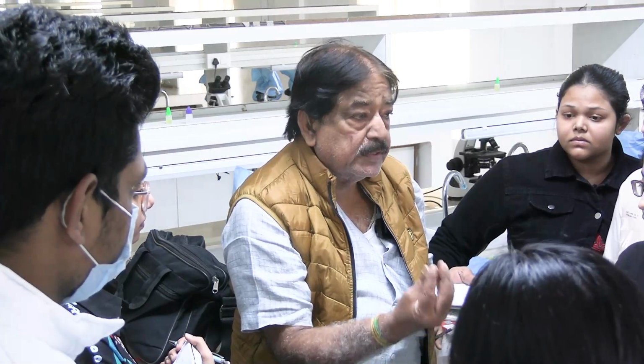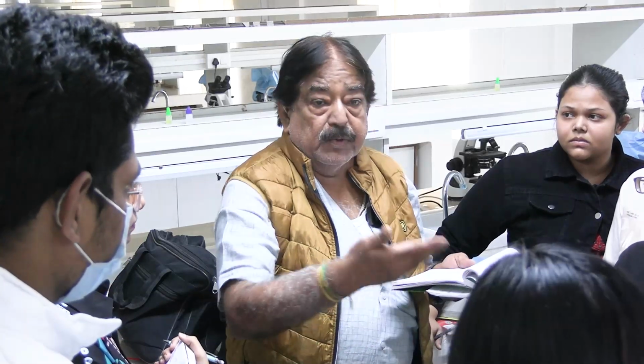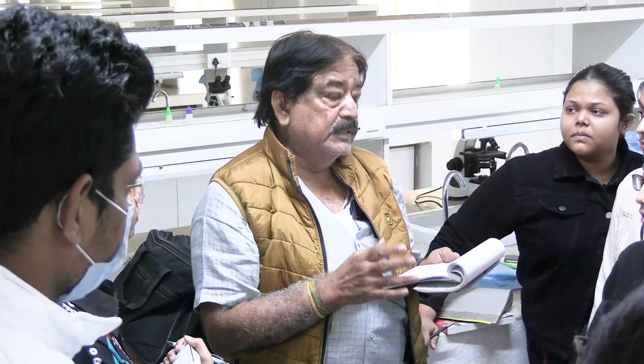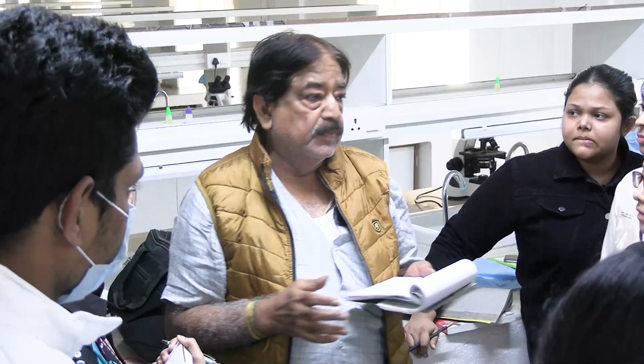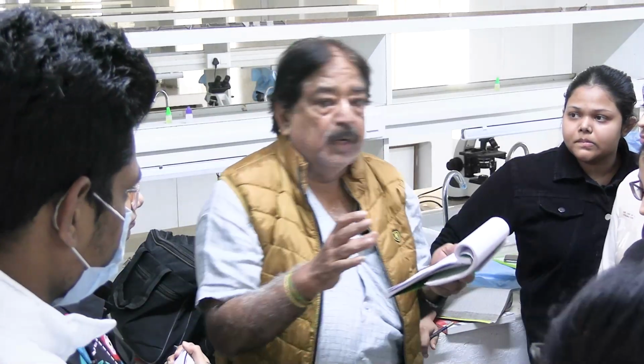It gets frozen in the block. You put it, and slowly in that temperature you cut. These frozen section biopsies are done in the operation theater of big institutes. I don't know which hospital in India has it, but for example a colonic surgery is being conducted.